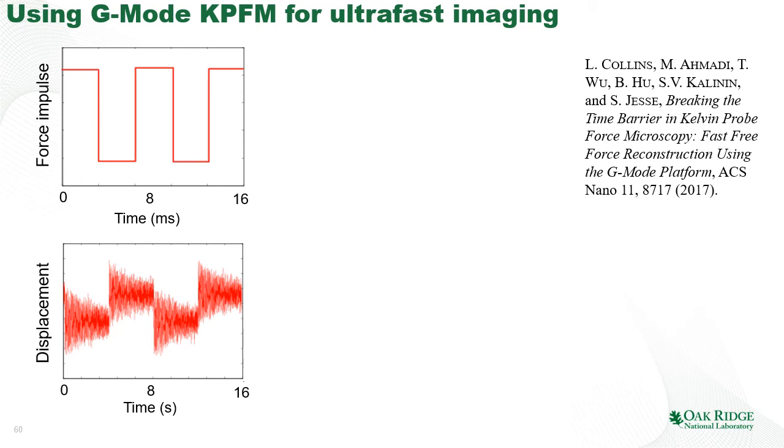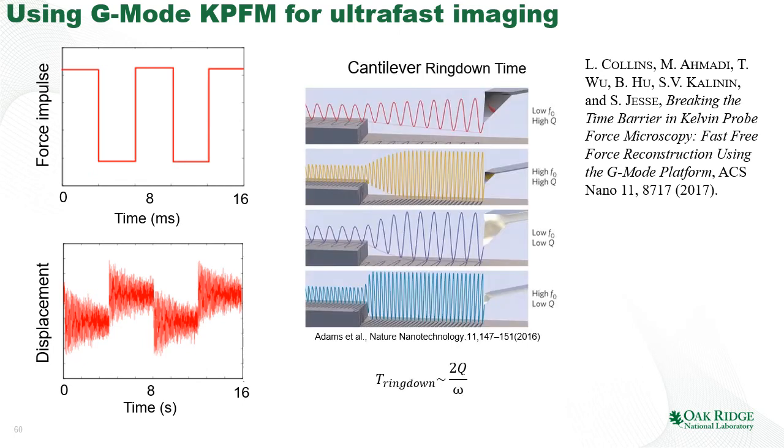So after each full force pulse, the cantilever starts to oscillate at its eigenfrequency, and it keeps ringing on the time scale determined by the Q factor. And this cantilever ring down time is understood extremely well as a function of the resonant frequency and the Q factor, and you can find this information in this paper by Adams and co-authors.